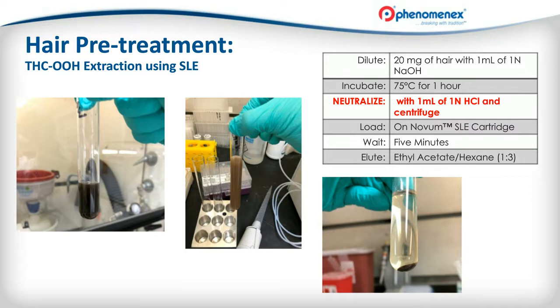Sample prep can be cumbersome, at least the pre-treatment part of it, even before we get to the SPE device, if we so choose. That's what we're going to do. So again, just keep in mind that there are other elements to this than just the on and off SPE that I'm going to discuss moving forward.